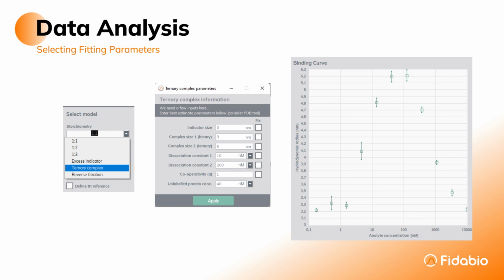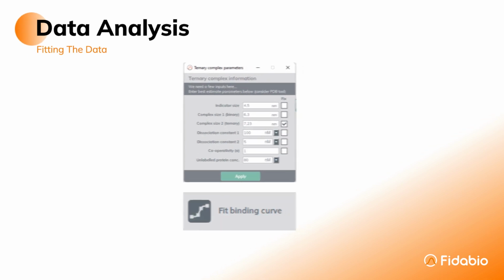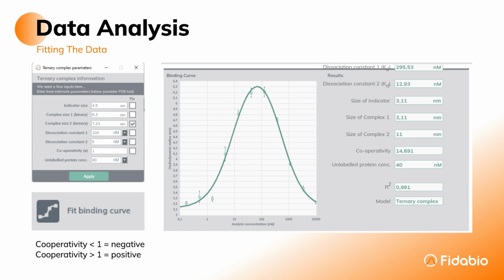A good initial guess for the cooperativity is neutral, i.e. a value of 1. Lastly, you need to tell the software the concentration of unlabeled protein in your assay. You then click Apply and click Fit Binding Curve. The results are then displayed on the right-hand side of the screen. We see that this bispecific molecule has a very high affinity for both its target proteins and has a positive cooperativity. In this model, a cooperativity bigger than 1 is positive, and a cooperativity smaller than 1 is negative.